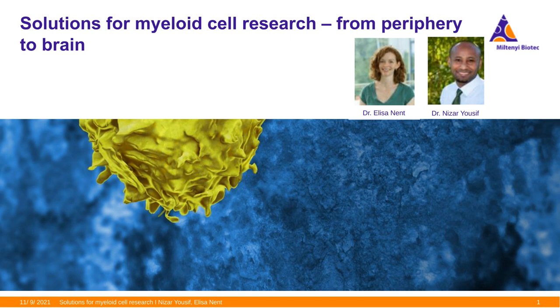I am trying to isolate infiltrating monocytes from inflammatory adult rat brain from the hippocampus. What is the best option? What is the best antigen to distinguish them from microglia?